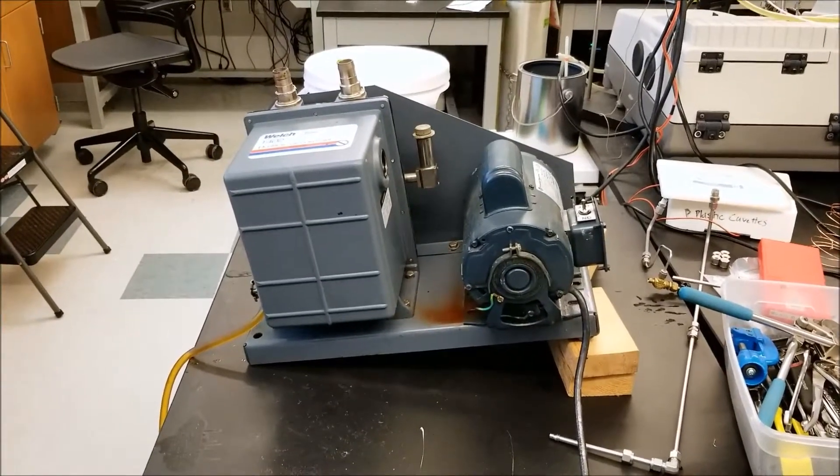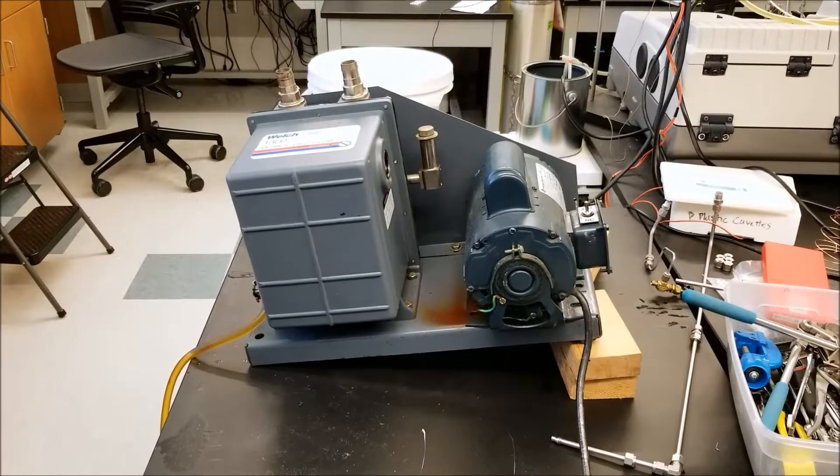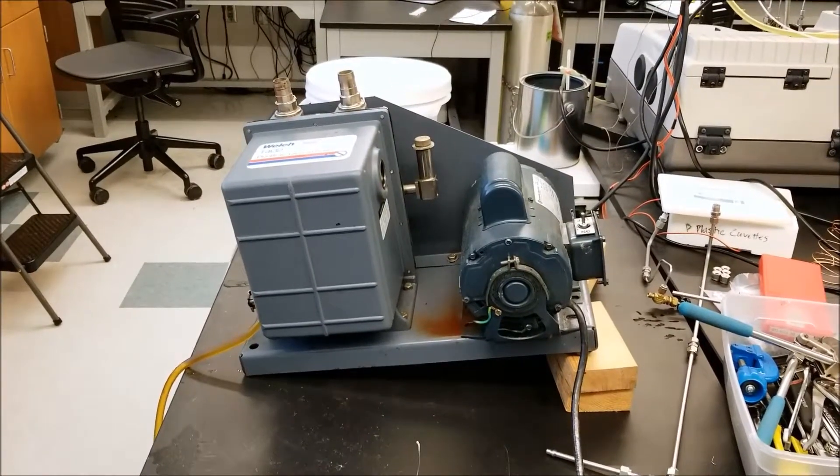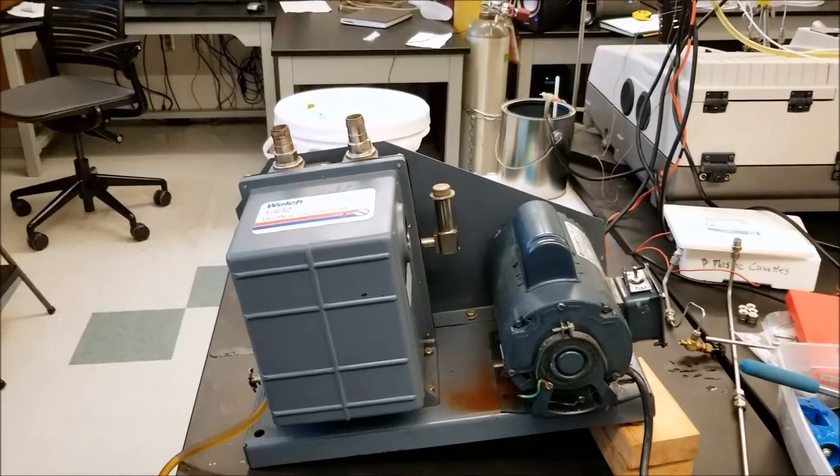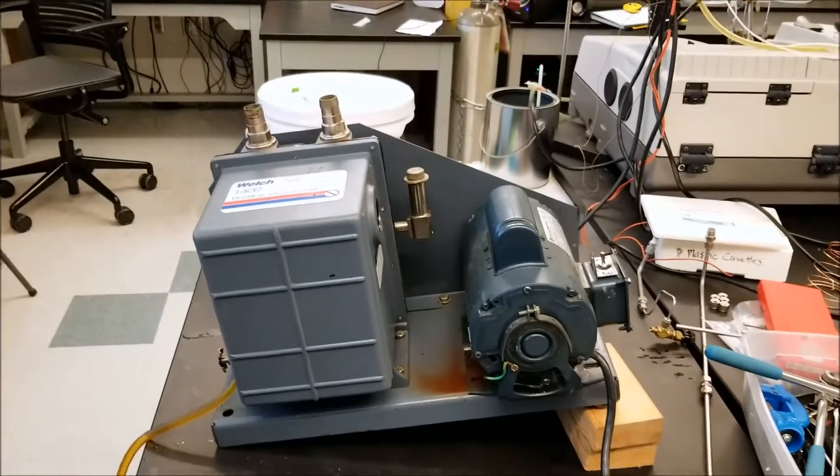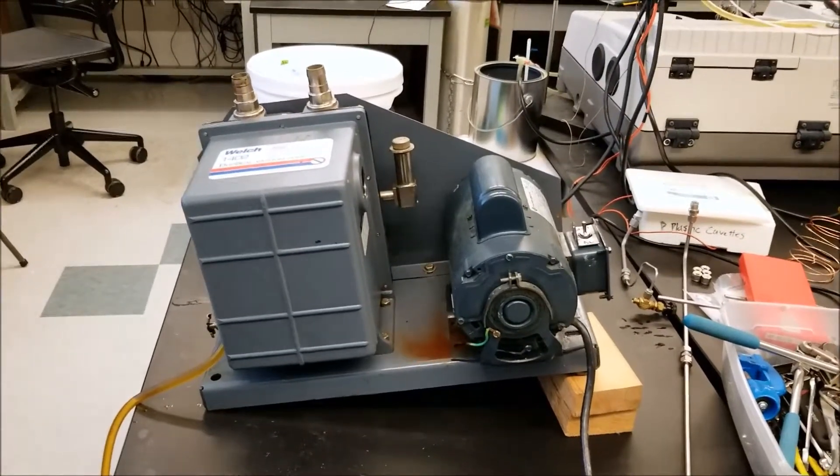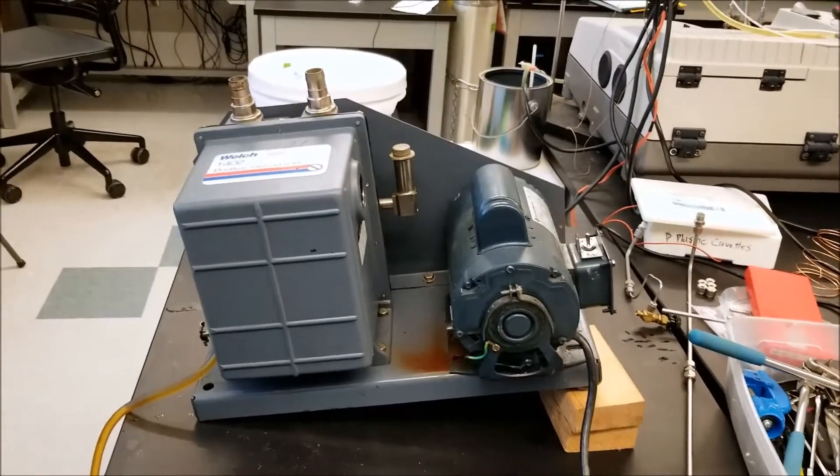All right, every six months we need to do an oil change on the roughing pump for the turbo pump system. Similar to a car, you need to change the oil periodically within the pump. We have it currently on a six-month schedule. The manufacturer recommends every four to six months.